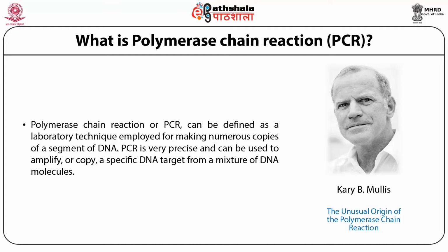Polymerase chain reaction, or PCR, can be defined as a laboratory technique employed for making numerous copies of a segment of DNA. PCR is very precise and can be used to amplify or copy a specific DNA target from a mixture of DNA molecules.